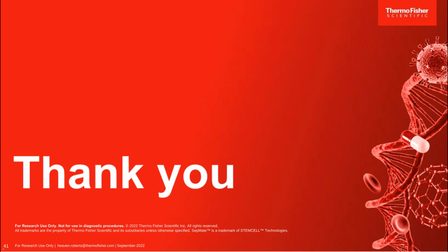And of course, you can take those images offline as well and do further adjustments to the brightness and contrast if you wish. If you feel like you acquired them and they're a little dark for your liking, you can brighten them up. We have found that sometimes when we're printing posters, it's good to make the images a little bit lighter because depending on the poster ink, they can end up being a little darker than you expected. But all of that is tunable in the software, and the images themselves have the same illumination across the entire sample.